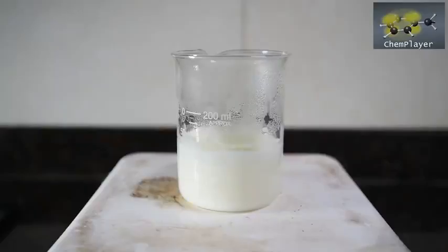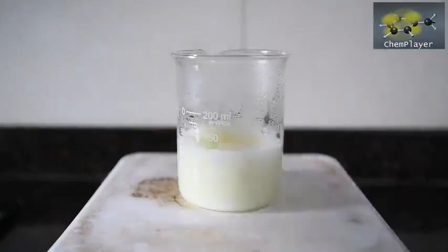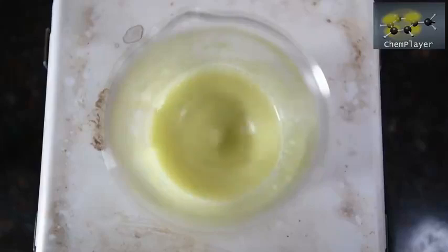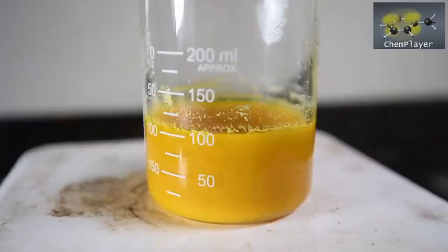We'll add the rest of the sulfur now. We're going to heat the mixture up to nearly boiling point and stir there for a while. We notice that the color starts to change after about 20 minutes of heating — it starts to become more yellow in color, and then slightly orange.